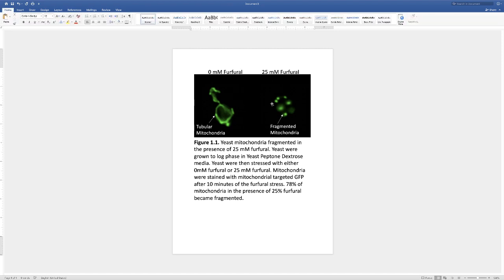Again, it's been cropped. I've labeled the 2 different types of yeast. I've identified structures in it, so I've annotated it properly. In my figure legend, I began with the bold figure 1.1. And then the first sentence is an active sentence, and it's the take-home point. And then I provide specific detail below for the best analysis of the figure by the reader.